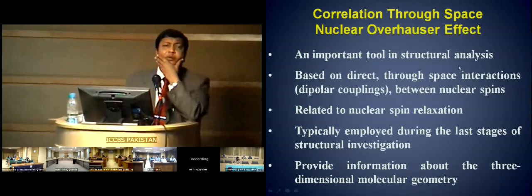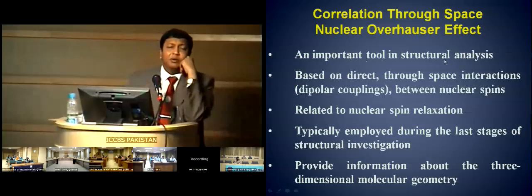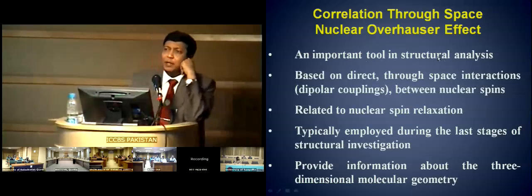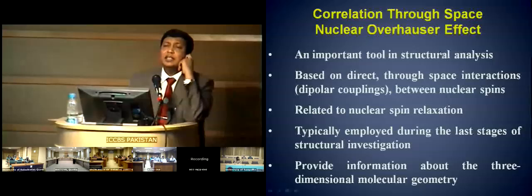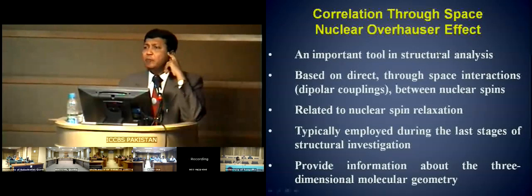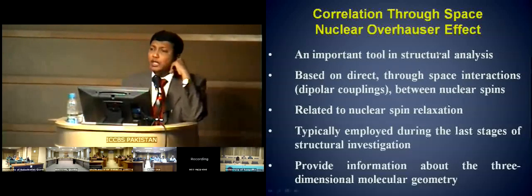Well, I want to take you to a discussion which we had about 2 weeks ago. Remember I told you that when people did broadband decoupling, they discovered an extremely interesting phenomenon. The peak intensity after decoupling was not just the cumulative collapse of a triplet into a singlet or a quartet into a singlet. It was more than that.